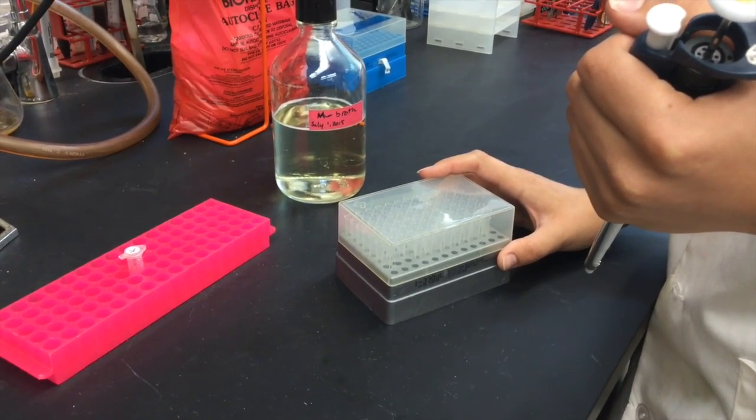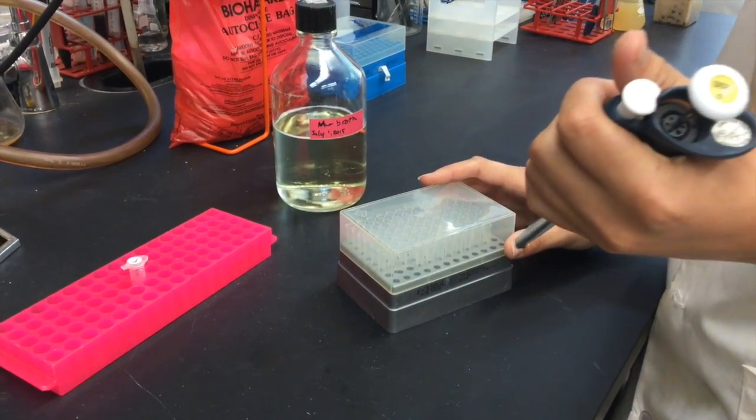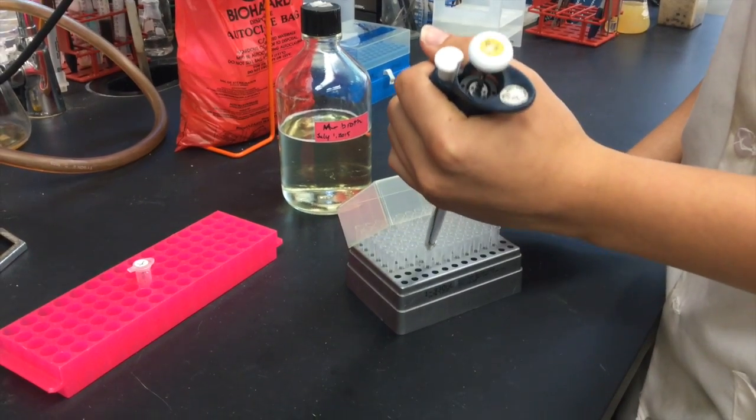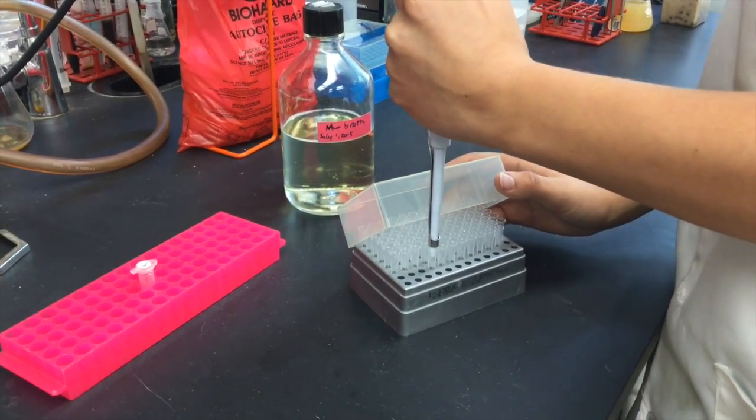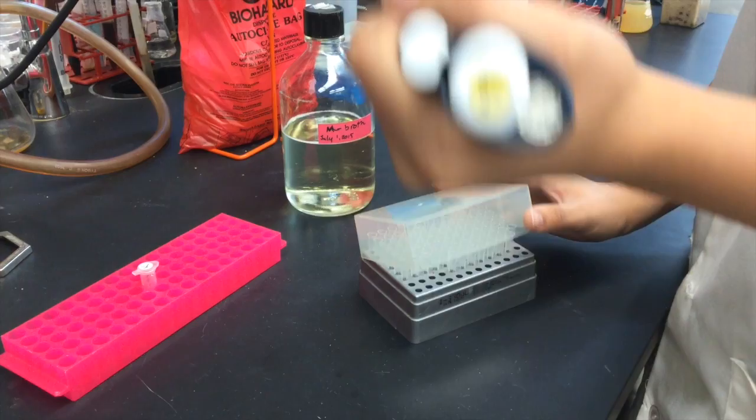Once you have reached the desired volume, you will need to place a tip on the discharge end of the pipetter. Open the lid just long enough to place a tip on the end of the pipetter and then close the lid.